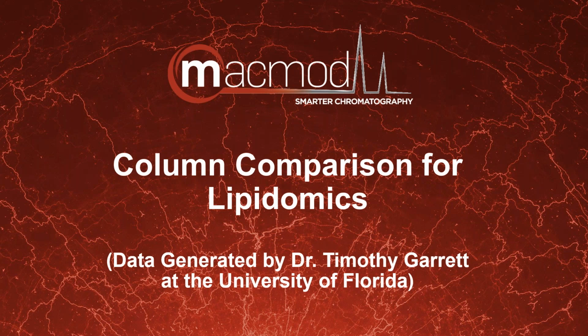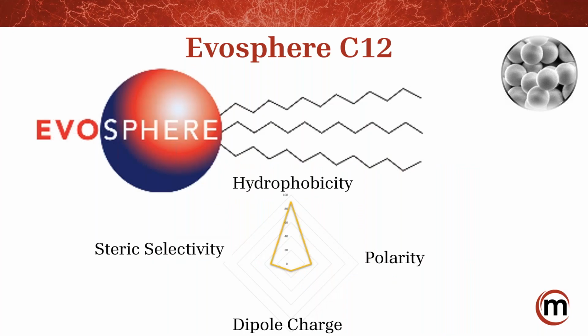I think the thing with lipidomics is, when you're blasting these lipids in a mass spec, they break apart, and so you can use the MS to really differentiate. Whereas on the metabolomic side, the column really has to come into play a lot, because it's really retention time that is the marker that you're using to know that these things are what we're claiming they are at the levels that we're claiming they are.